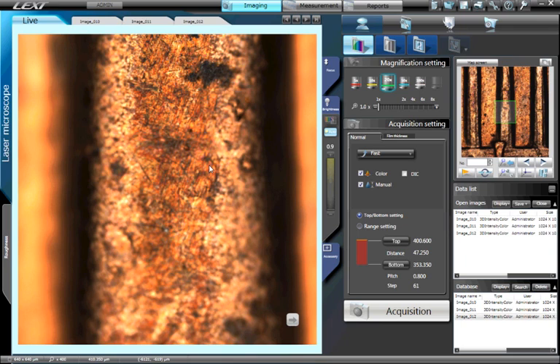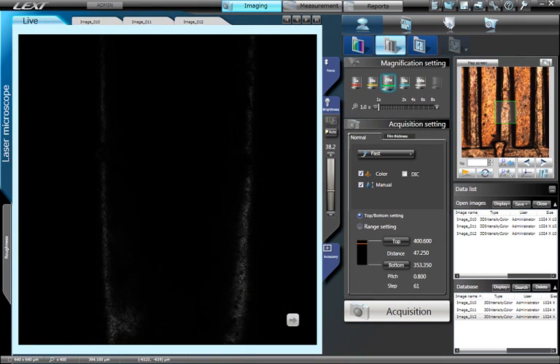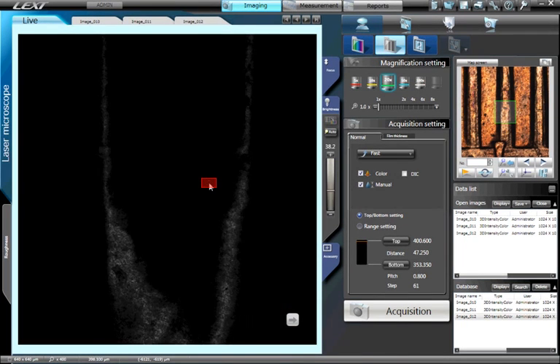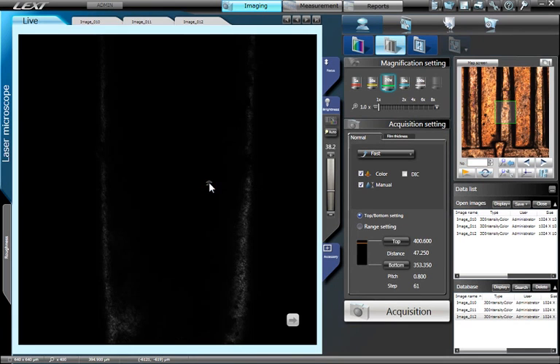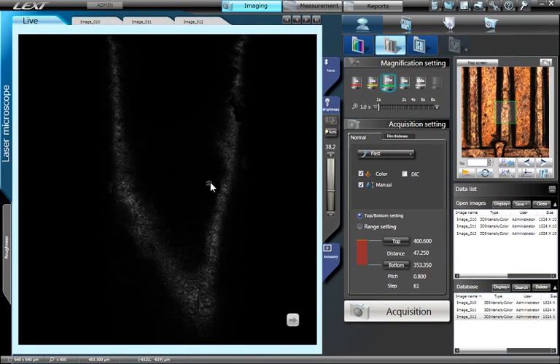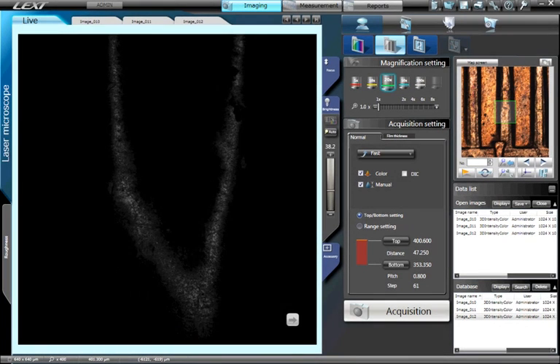Now, let's switch from color mode to laser confocal mode by pressing the laser button. When focusing, you will notice how laser confocal mode differs greatly from color mode in the sense that only the in-focus sections of the image are visible.